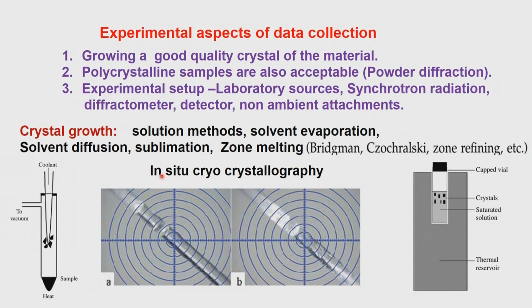The other approach, which has essentially developed in very few laboratories, and one of the laboratories happens to be our own, is the use of in situ cryocrystallography. Here, there are lots of solvents which are used in the crystallization process, and the solvent structure becomes very important, whether it has a certain property related to it, like the associated dipole moments and so on. If it is a subpolar or a non-polar solvent, what is the influence of those solvents? In order to know about that, we have to crystallize the solvents themselves.